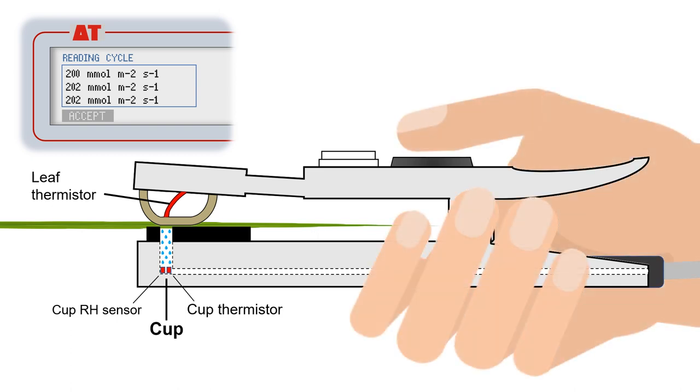Signified by a double beep, the user can then accept the reading by pressing the button on top of the sensor head.